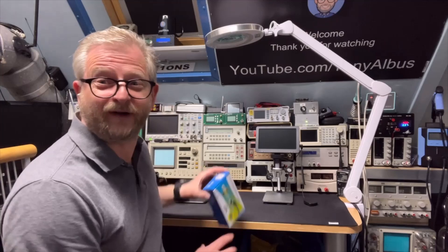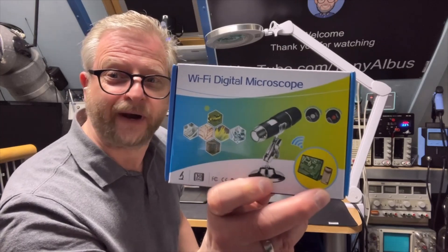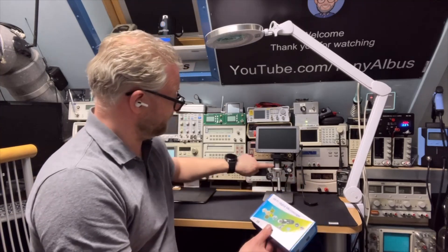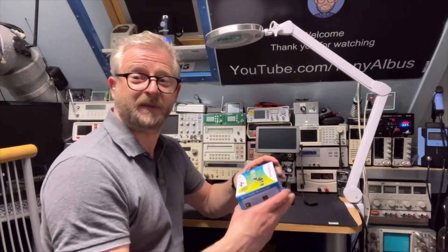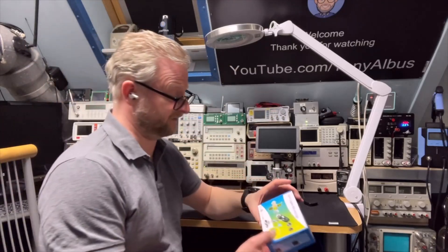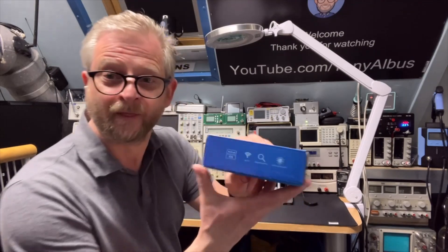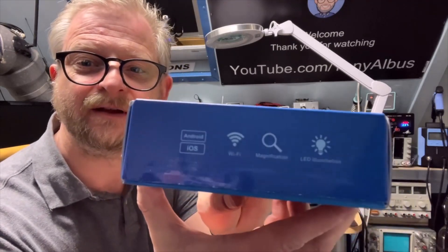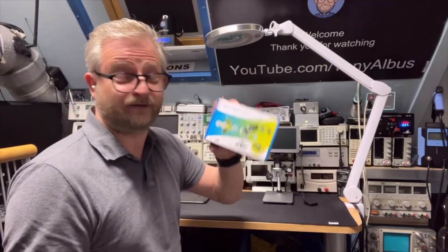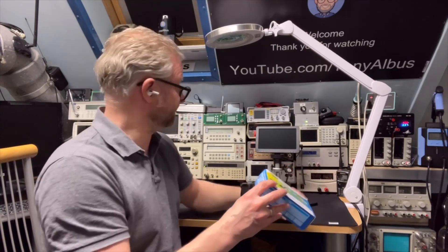But I also found this one — it's a little Wi-Fi microscope, and it seems that it is more or less the same. But of course without the screen and without all the things. It only works with Wi-Fi if you have an Android or iOS device. It's below $10, and it's nice to play with. It also has LEDs, just like the other one.